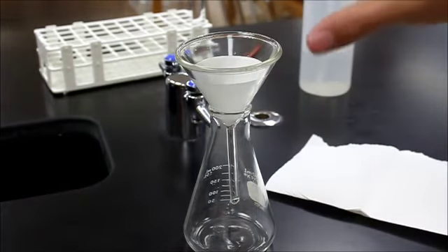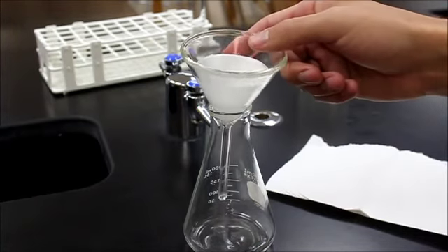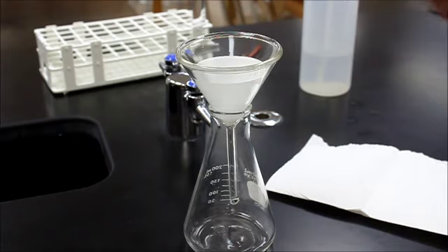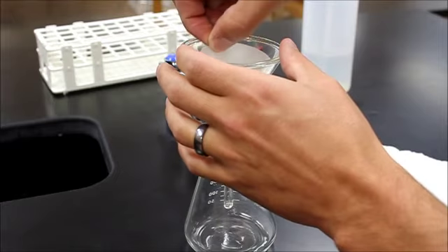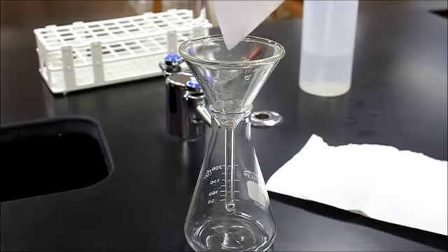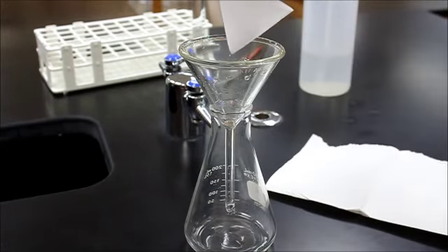Once you're done filtering your silver product, I didn't put any silver product into here, the next thing you need to do is you need to dry your filter paper. Now that's going to be an overnight process. It's going to take some time to dry, but the way that you're going to set it up to do that is first you're going to reach in and just touch the very edge. You're going to try and pull your filter paper out. This is going to have your product in the bottom of it.